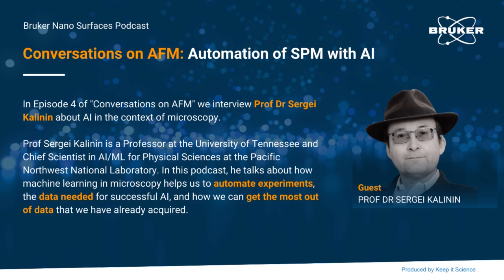So this is, again, an excellent question. And there are multiple ways we can look at automation. From some perspective, imagine that we have a large sample, for example, a wafer. The AFM scanner range is limited. So how about we use an AFM to simply take a dense mesh of images, so we map the whole surface of this wafer. You can argue that this is a simple form of automated experiment as well, but if you think about it, something seems to be limiting in this type of definition.